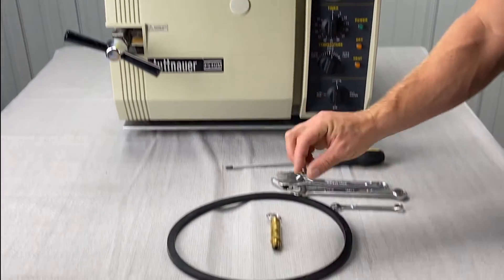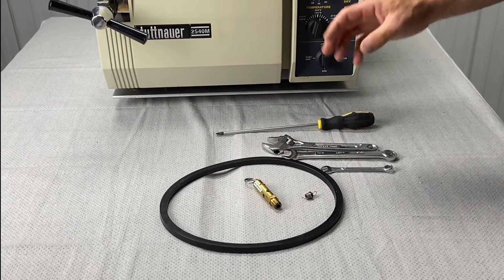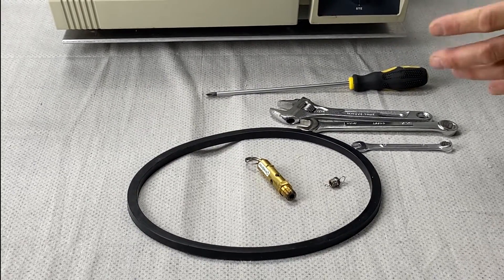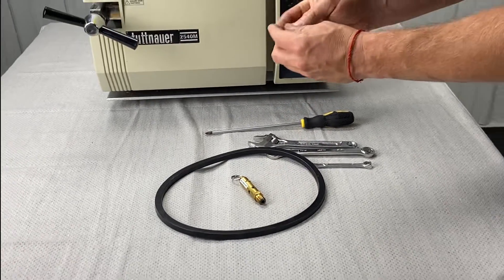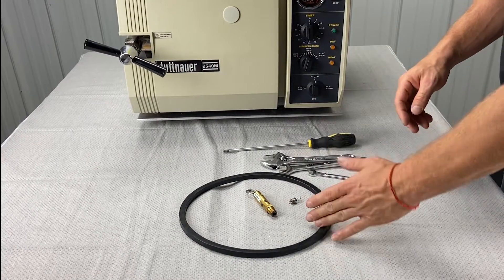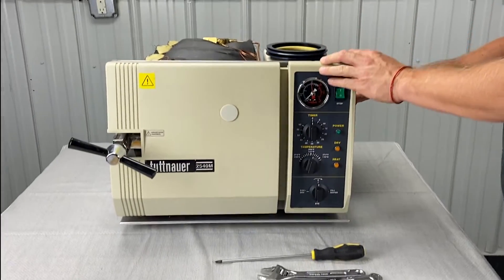They have a door gasket, an air jet, and a safety valve. Depending on what you have — 2340, 1730, 3870, or 2540 — the gaskets are going to be bigger, and the 220 units will use a red one. But the replacement and installation of the door gasket is going to be the same.